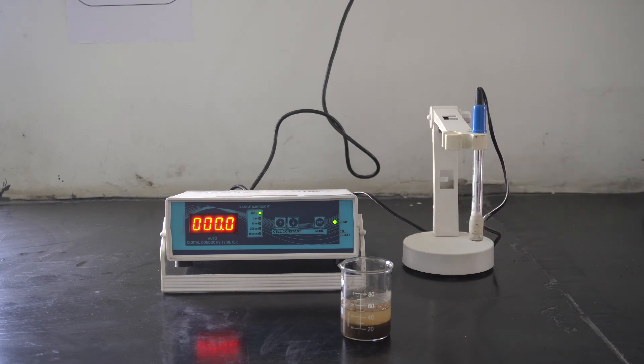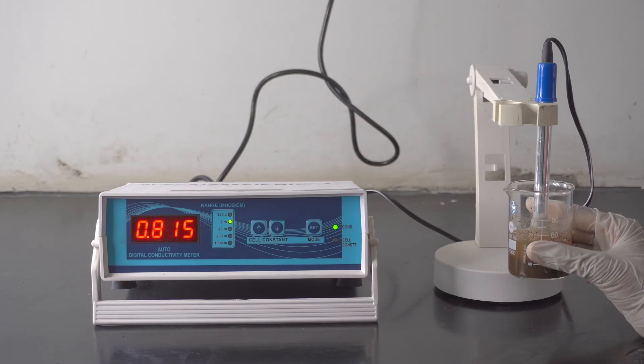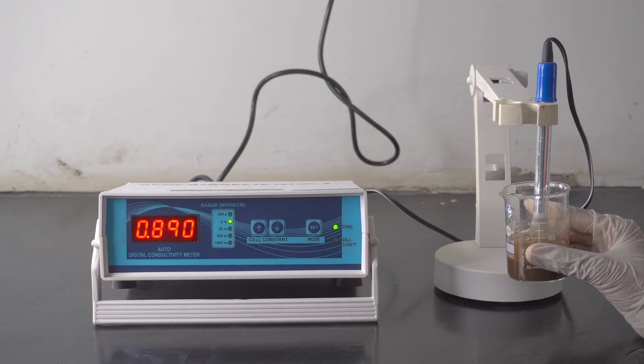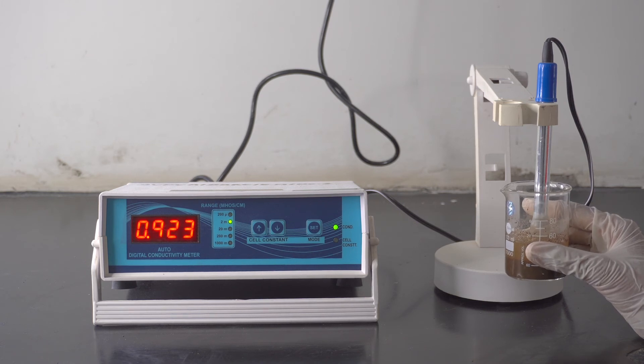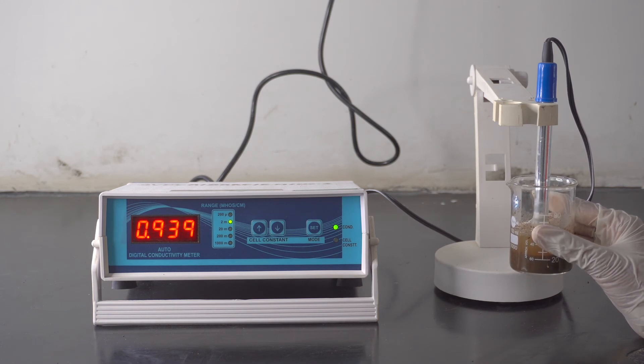Lastly, place electrode in settled soil mixture and measure electrical conductivity of saturated extract which is visible above settled soil mixture. Once we get the reading, record it in notebook.